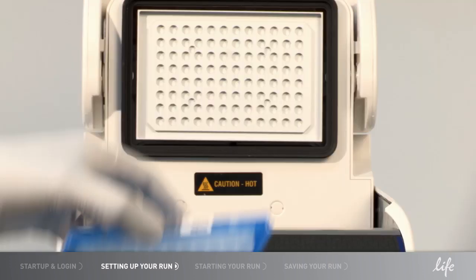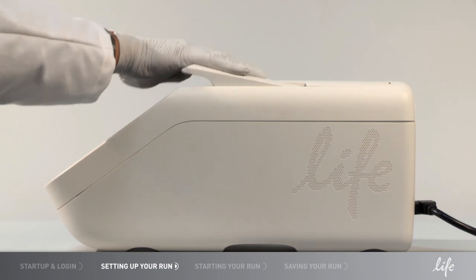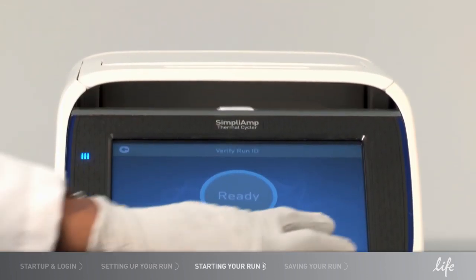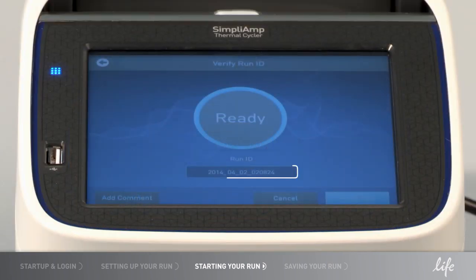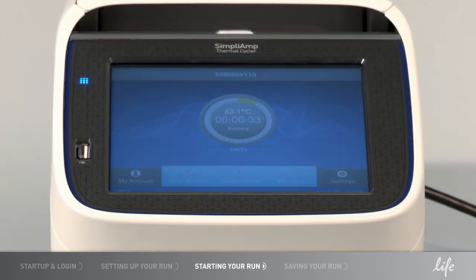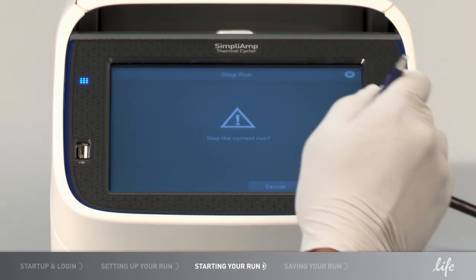Load your samples into the block when ready. Select Start Run and your run will begin. You can also edit your run ID if you wish. You can monitor your run as it is cycling, and when your run is complete, you can choose to end it or set it to incubate.